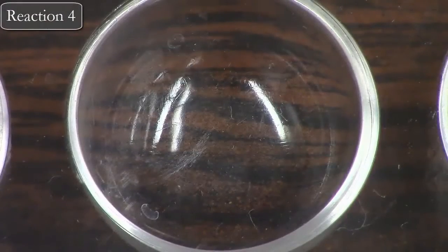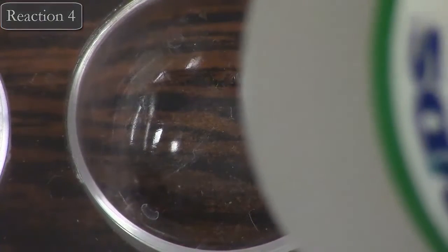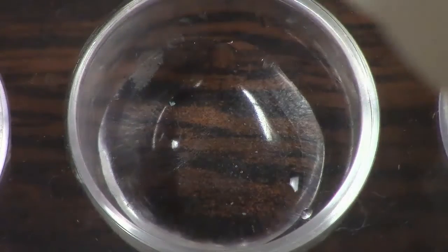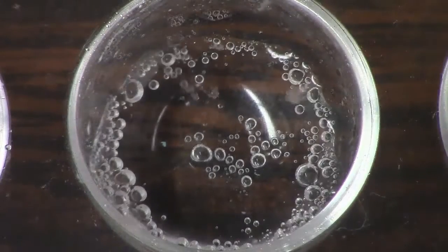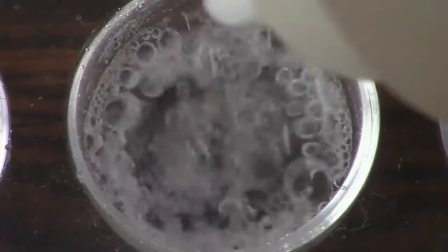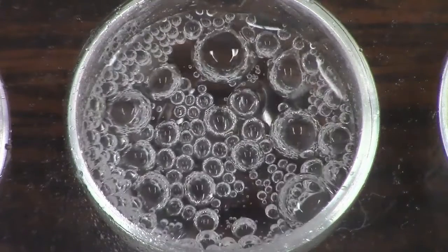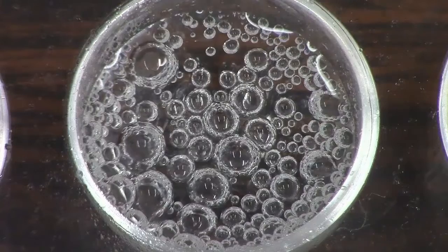Right, in our fourth reaction, we will take a few drops of sodium carbonate, and we're going to add that directly into a free spot on the well plate. So you have our sodium carbonate. Take some observations about what that looks like on its own. And then in that same spot, we're going to add a drop of hydrochloric acid. Right, so we're seeing a fairly aggressive reaction there. So record your observations, and then based on that, predict what products might have been formed through that reaction.